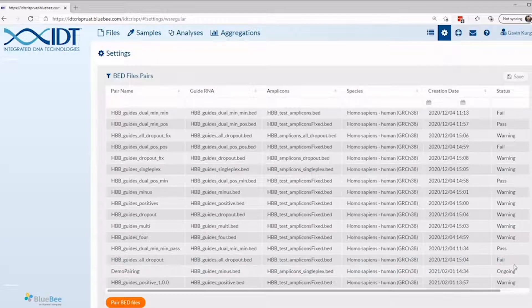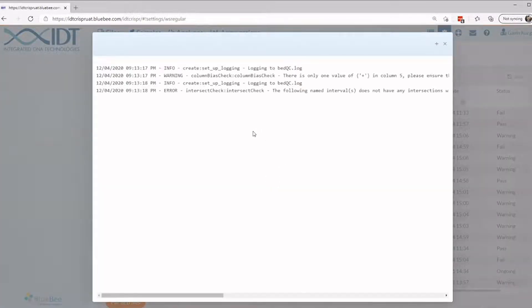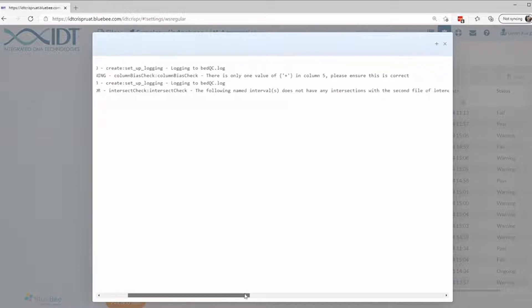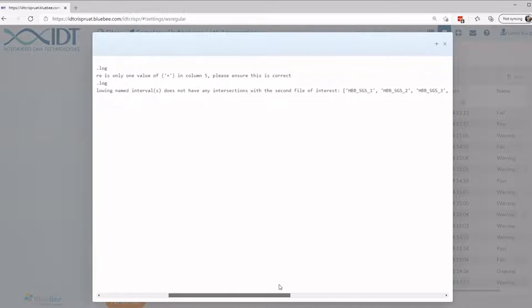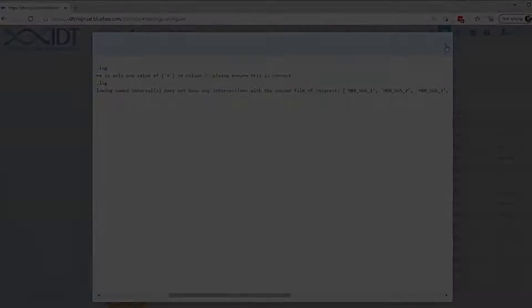If a fail status appears, there is something wrong with your bed inputs. Please check the log and correct your files accordingly to fix these issues. That completes the process.